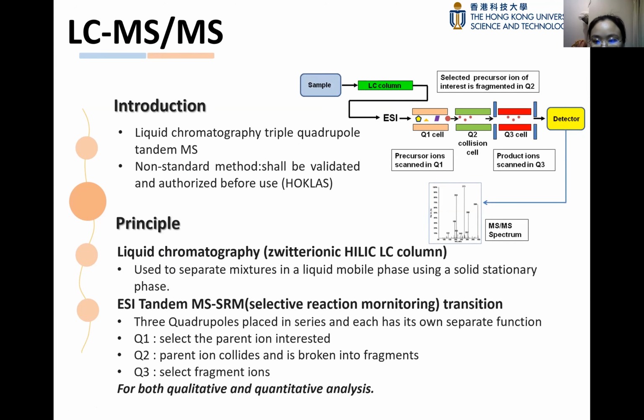According to the reference, liquid chromatography combined with triple quadrupole tandem mass spectrometry is applied for melamine quantification. This is a non-standard method. Thus, it should be validated and authorized before application in the laboratory.